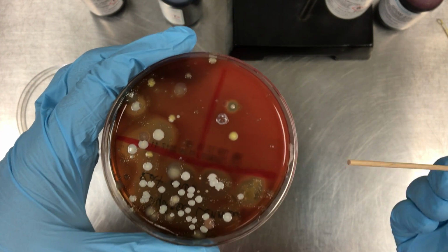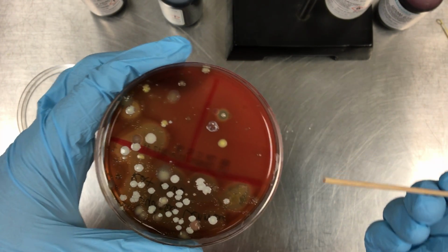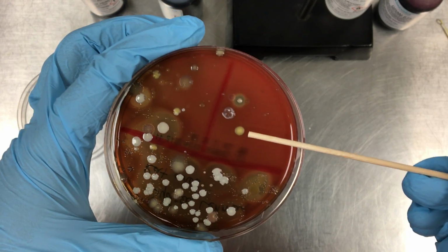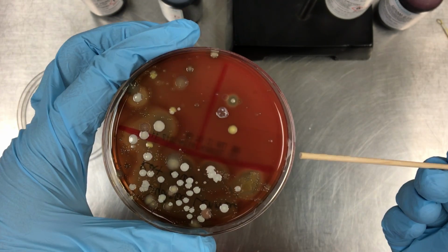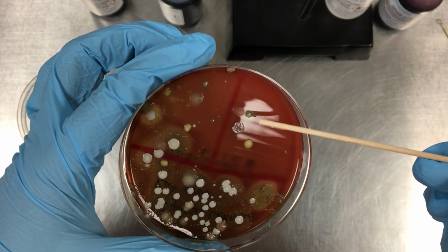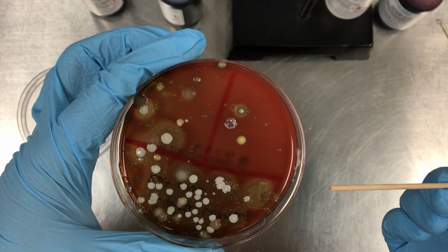Now also for your gram stain lab, you're going to be asked on your lab report about the zone of hemolysis around the bacteria colony that you sampled. So look back over the lecture notes if you need a refresher, but you want to take note of what type of hemolysis was displayed around the bacteria that you chose.